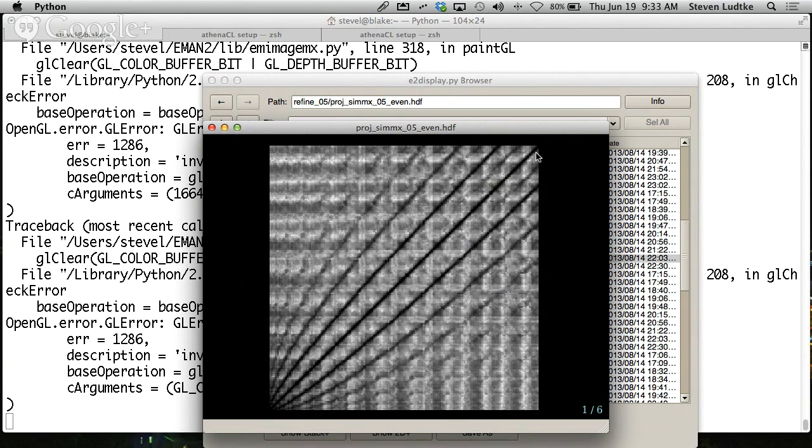If you remember, I said lower values, darker values indicate higher similarity in EMAN 2. So regardless of the similarity metric used, if you say a dot product is a similarity metric where you'd expect 1 to be good and -1 to be bad, whenever we use a similarity metric like that, we invert it. So the dot products are all multiplied by -1. So -1 indicates perfect correlation and 1 indicates 0 correlation, just to obey this convention. Because there are other metrics, for example, the RMS deviation between a particle and a reference where smaller is better. So we had to pick one convention. Is smaller better or is bigger better? And we picked smaller.